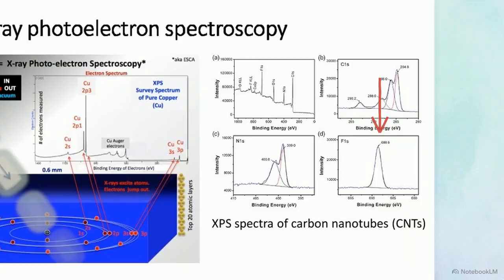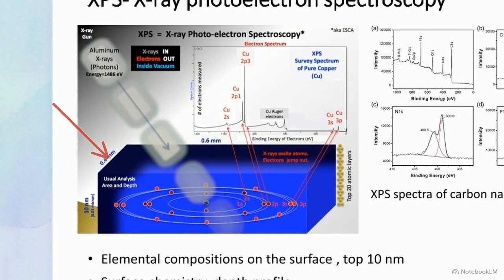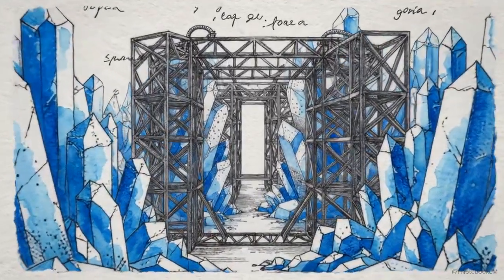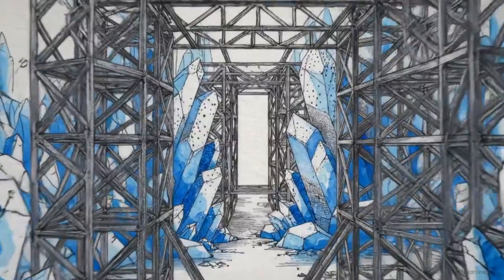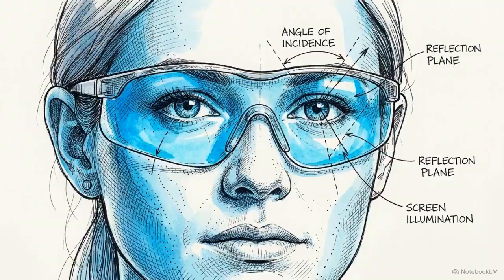These 4 line graphs are chemical readouts. The sharp spikes act as elemental signatures, identifying chemicals present in the sample's top 10 nanometers. This cross-section highlights scientists targeting those uppermost atomic layers, causing electrons to jump out to help engineers design more effective materials. There is an incredible hidden universe of microscopic mountains, internal scaffolding, and atomic data that is completely surrounding us. We only have to change our light to see it.